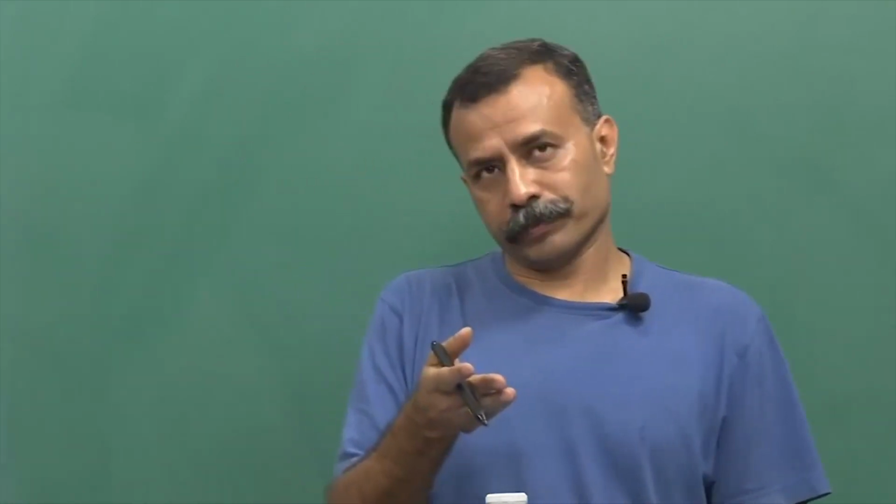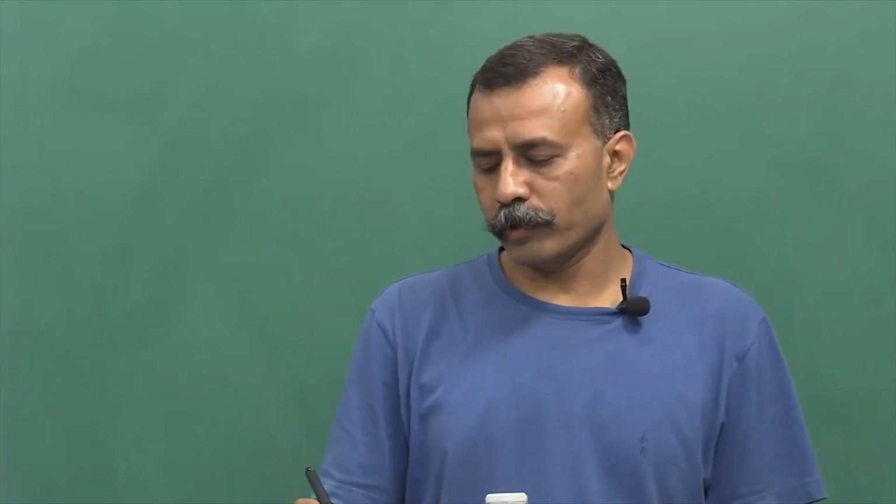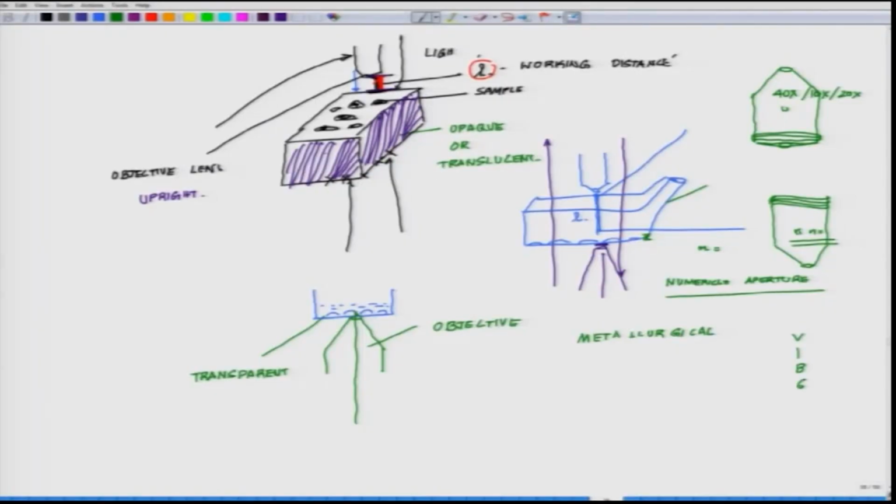So there are 4 zones where you can play. You have a UV, for blue, you have, if you put it like this, it will make it easy. You have blue, you have UV before that, okay. You have green, you have red, and you have far red. This is the kind of zone where you are playing this game. So be careful whatever you are asking. Whatever you ask, you will get that.